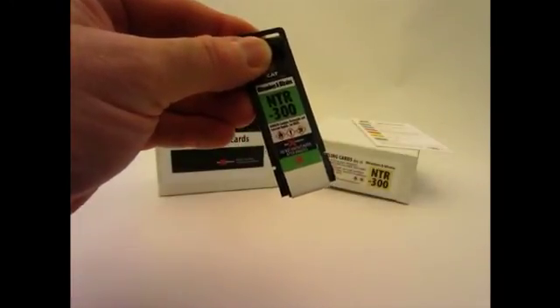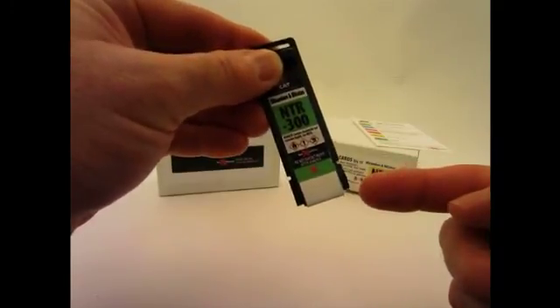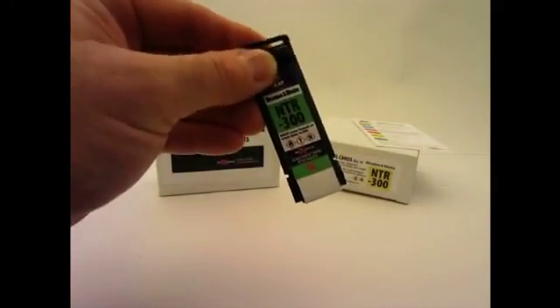Using the sample cards: each sample card has a white sample collection paper located directly below the label at the bottom of the card. When handling the sampling cards, do not touch the sample paper with your hands to avoid contamination of your sample.